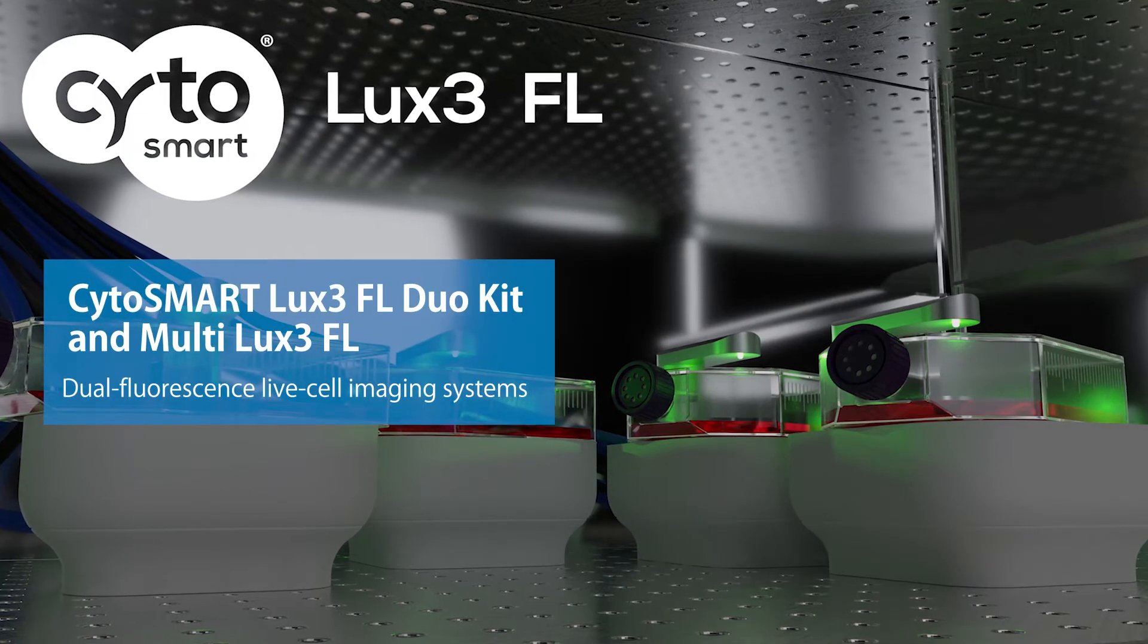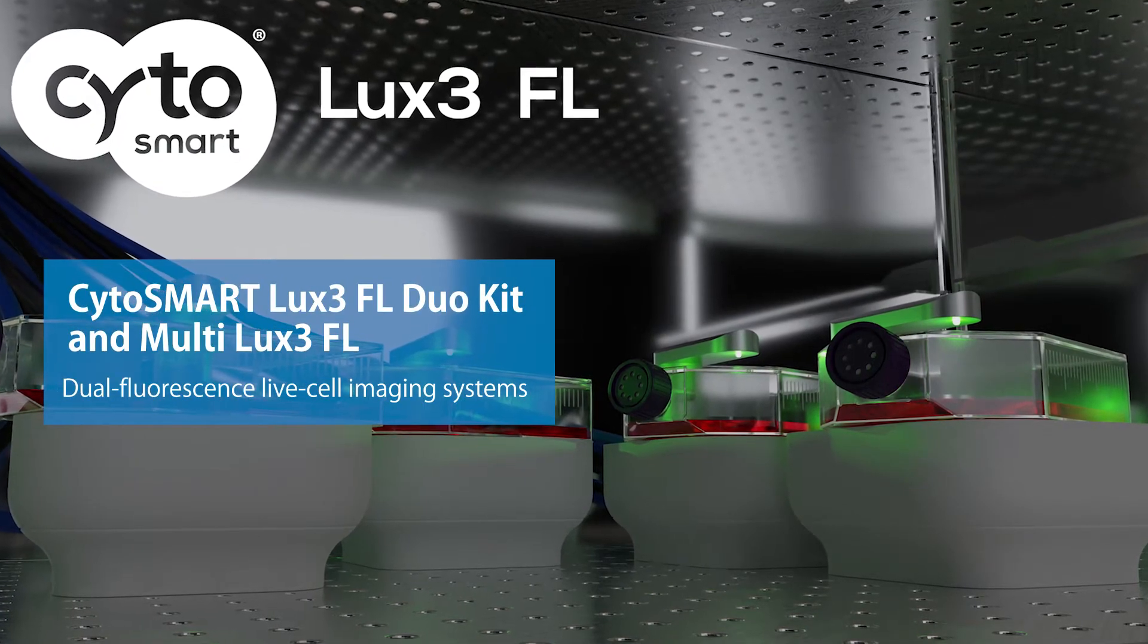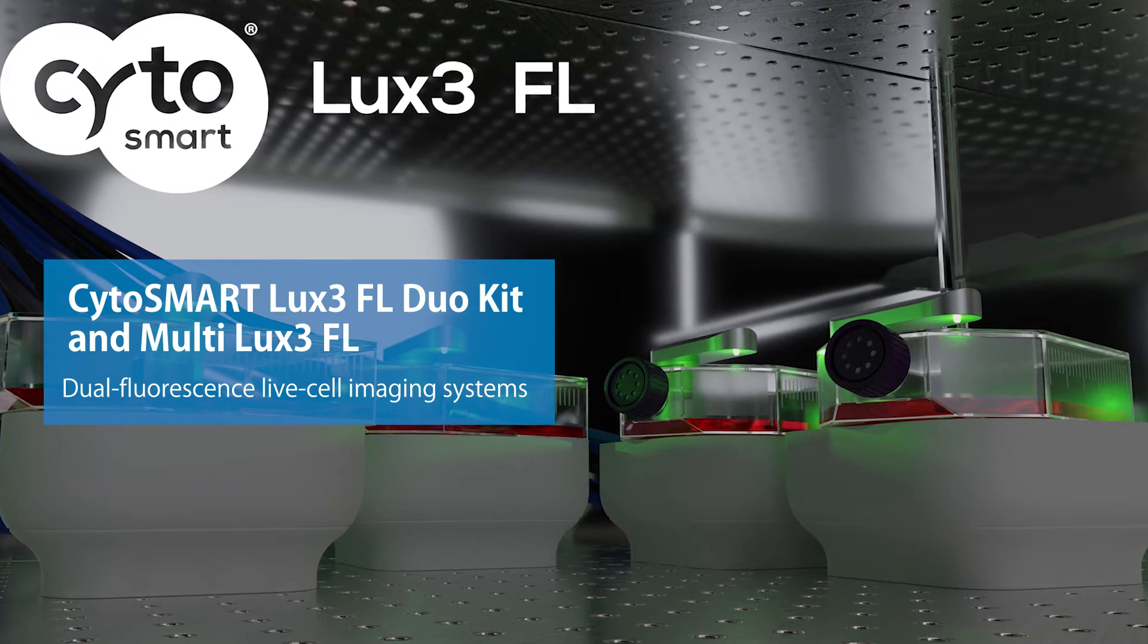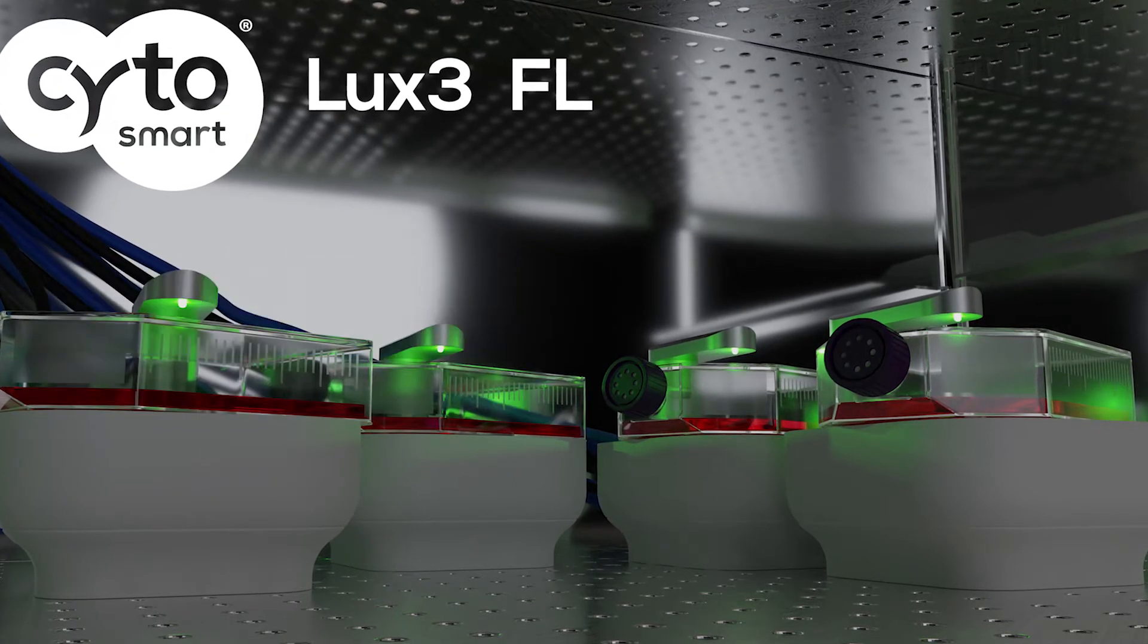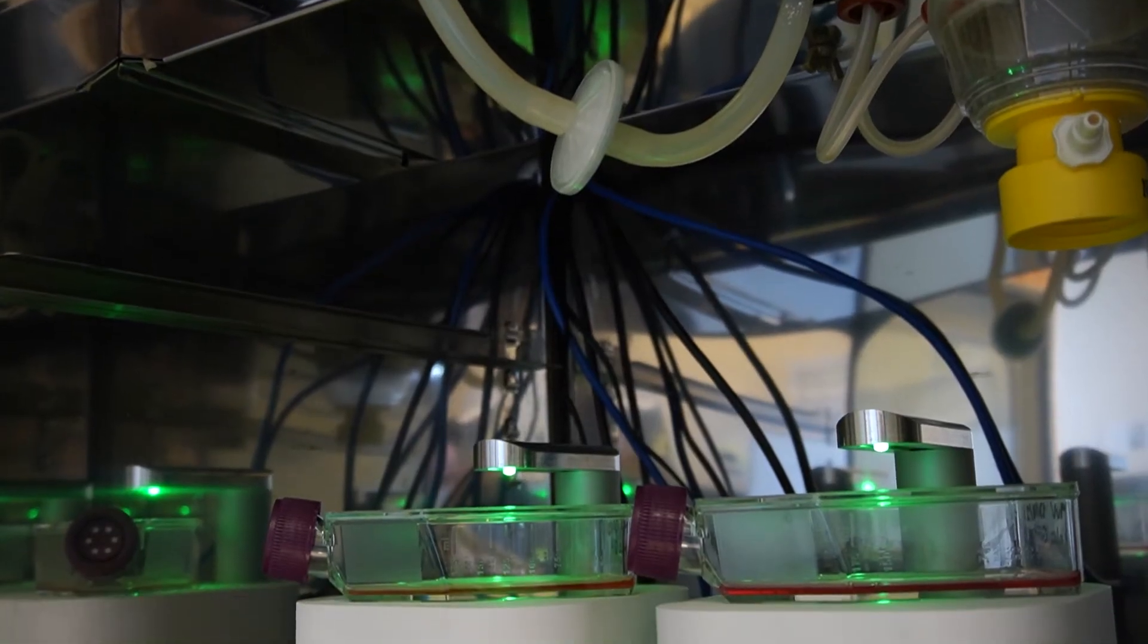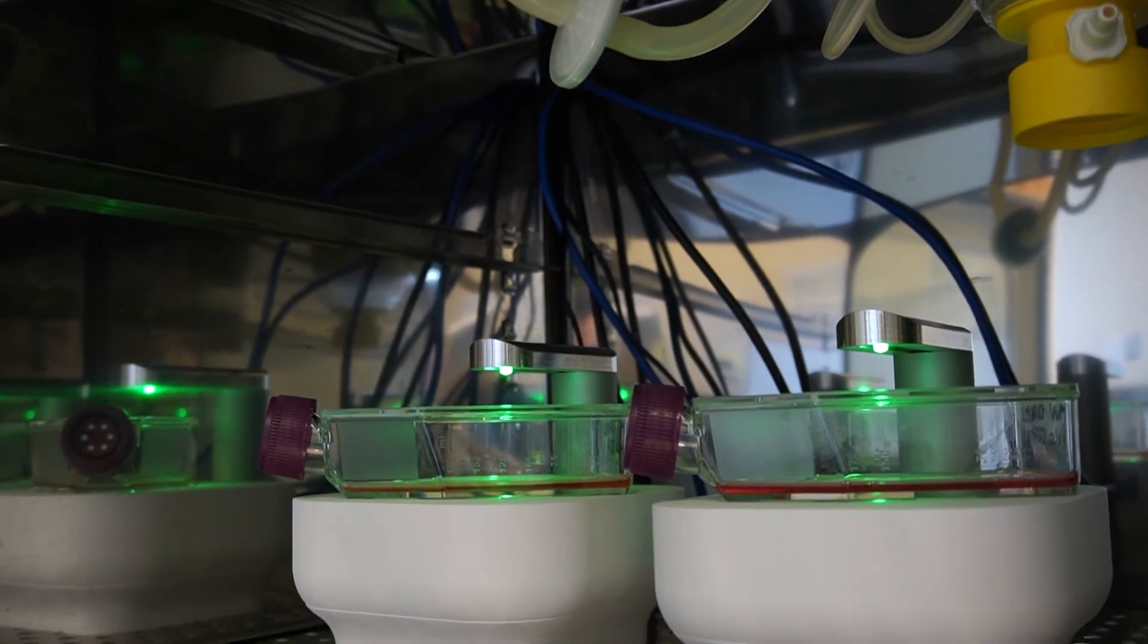The Cytosmart Lux3FL Duo Kit and Multilux3FL are dual fluorescent live cell imaging systems. Monitor and directly compare your fluorescently stained cells inside your cell culture incubator.